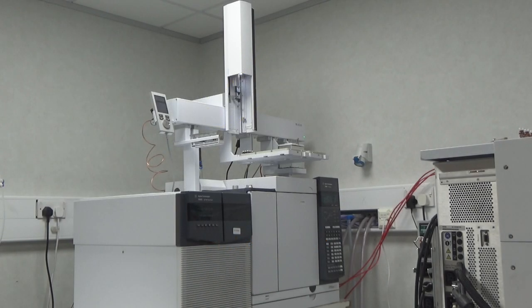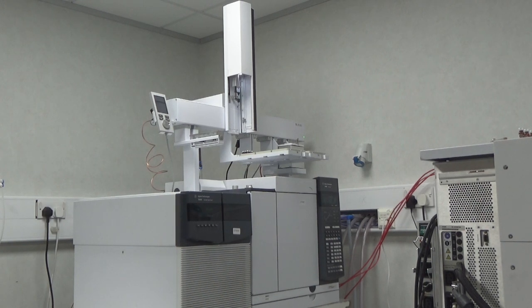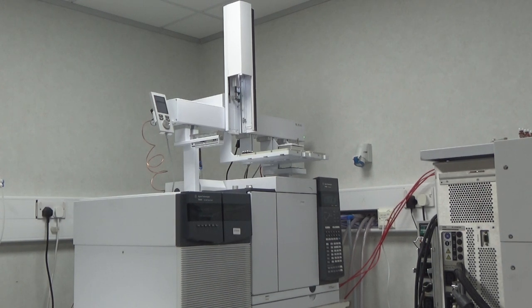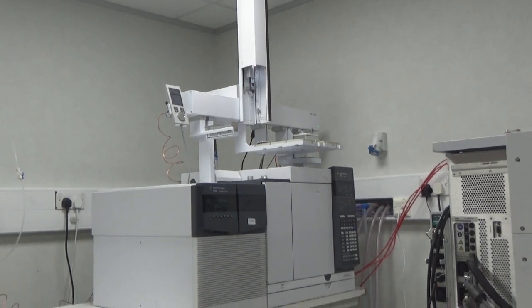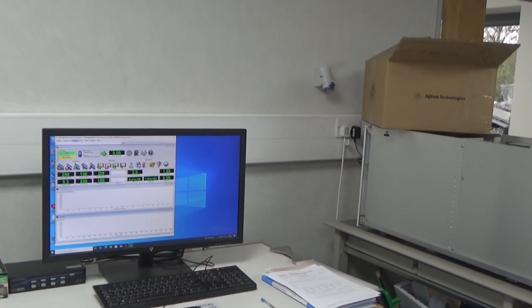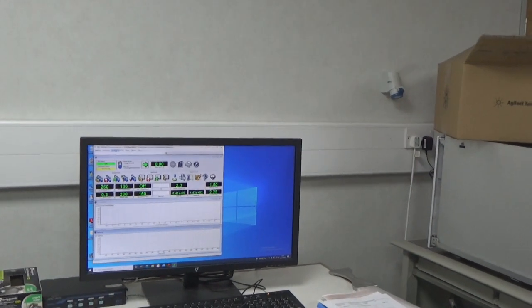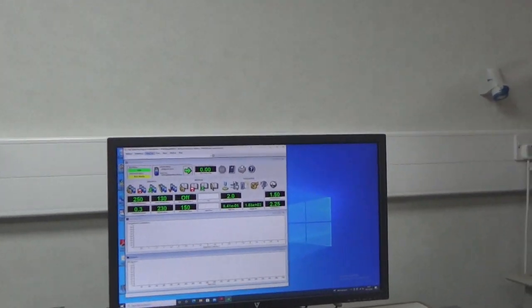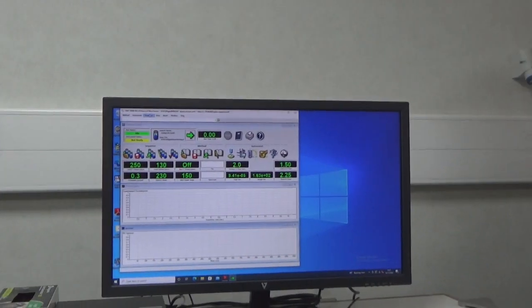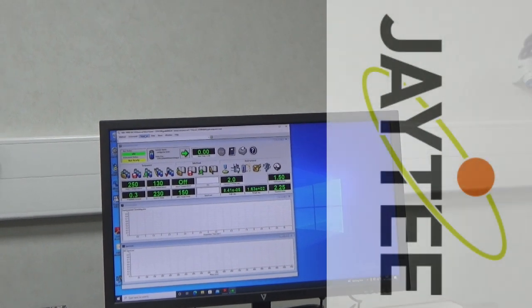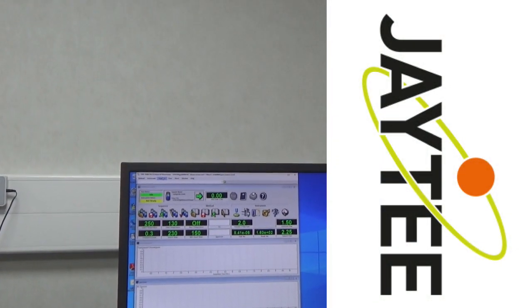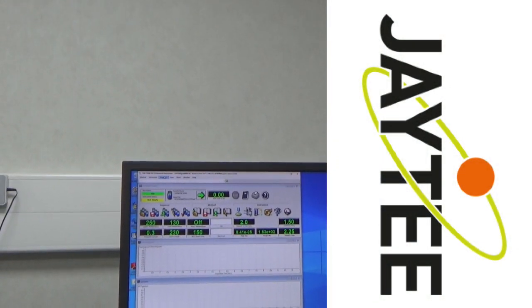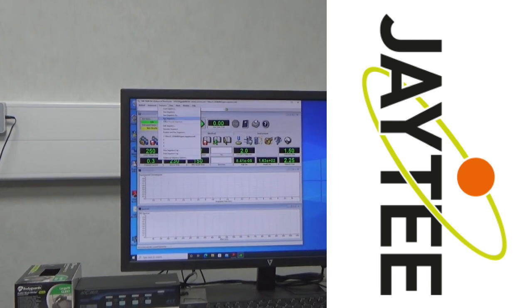I'm going to demonstrate today our Agilent 7000C triple quad GC mass spectrometer. I'm going to set the instrument down and we're going to analyze 100 femtograms on column, that's 10 to the minus 13 grams of octafluoronaphthalene actually on column using this system. So I've set the sequence up.